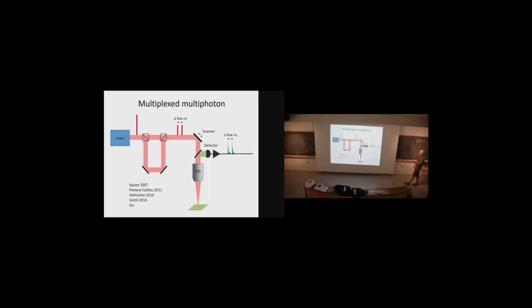Right? And if you do that, then the fluorescence from a single pulse now gets doubled. There's 2 pulselets that hit my plane here, and so I get 2 fluorescence pulses out. Right? And you might say, well, what's the point of that? Well, the point is, if I now put a lens in one path so that these paths focus at different depths, then each one of these pulses, pulse 1 and 2, focus at different depths.